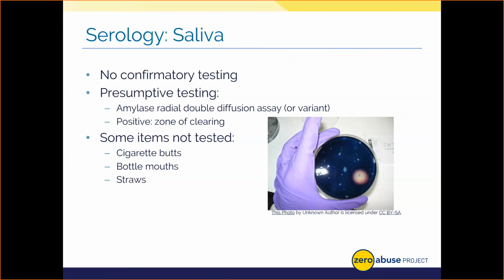Well, we start with a petri dish like the one on your screen, made of a sterile starch agar. Basically, agar is just a jelly, and we infuse starch inside of it. We mix it in there. And starch is nothing more than a complex carbohydrate or just a complex sugar. We then cut small wells or holes in the agar for our samples. Next, we're going to add those samples to that plate.